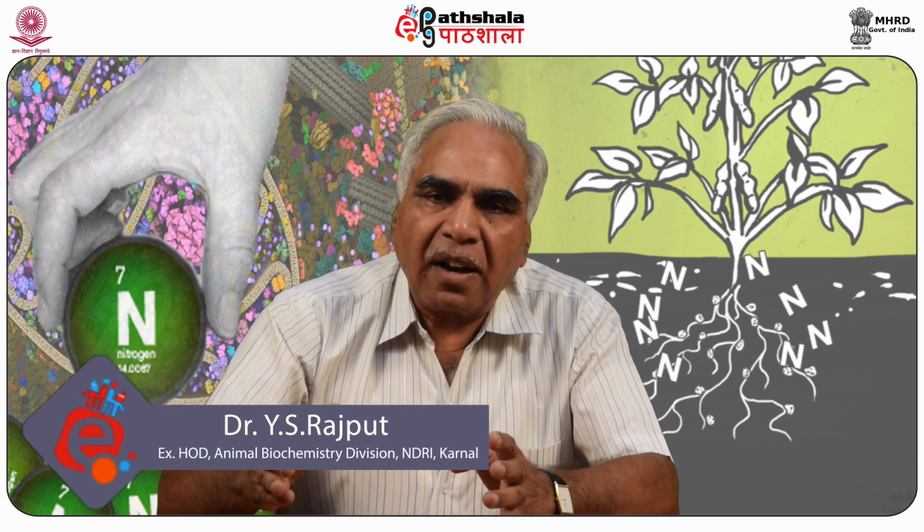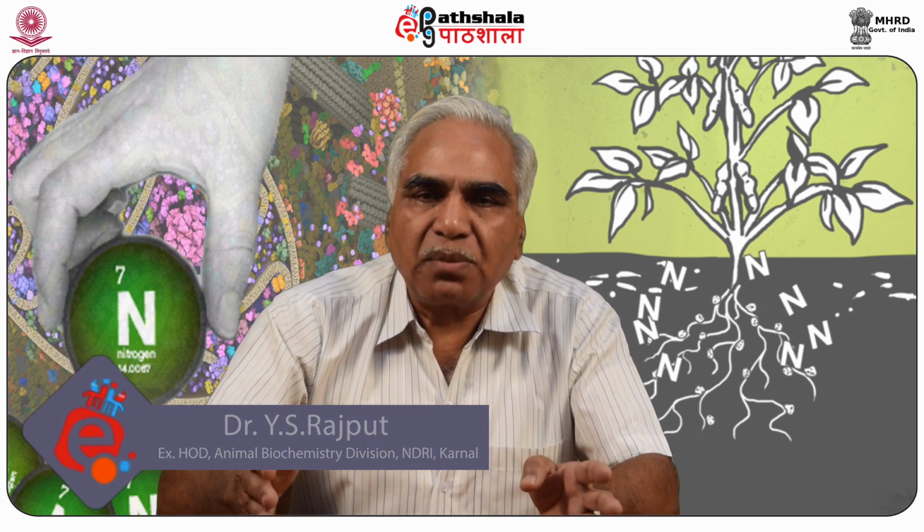Agarose gel cannot be used in vertical gel electrophoresis simply because of the poor elasticity, and because of this, if we want to remove the agarose gel from a vertical unit, it will lead to cracking and recovery of the gel becomes very difficult. So these are a few fundamental differences between agarose gel electrophoresis and sodium dodecyl sulfate polyacrylamide gel electrophoresis. But as a routine matter, the acrylamide gel electrophoresis is used for protein separation in electric field, and the agarose gel electrophoresis is used for the separation of the nucleic acids in electrophoresis. Thank you.